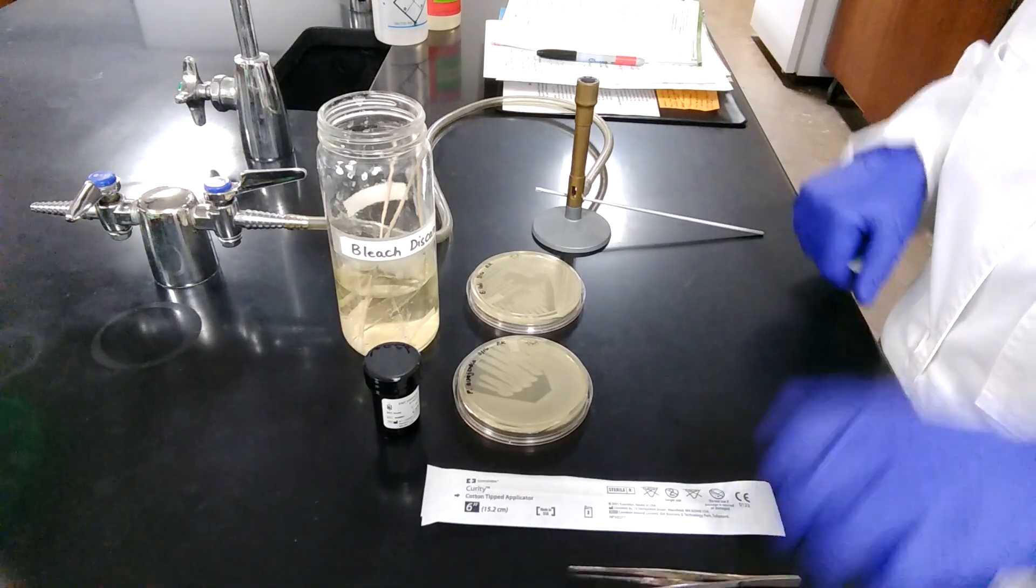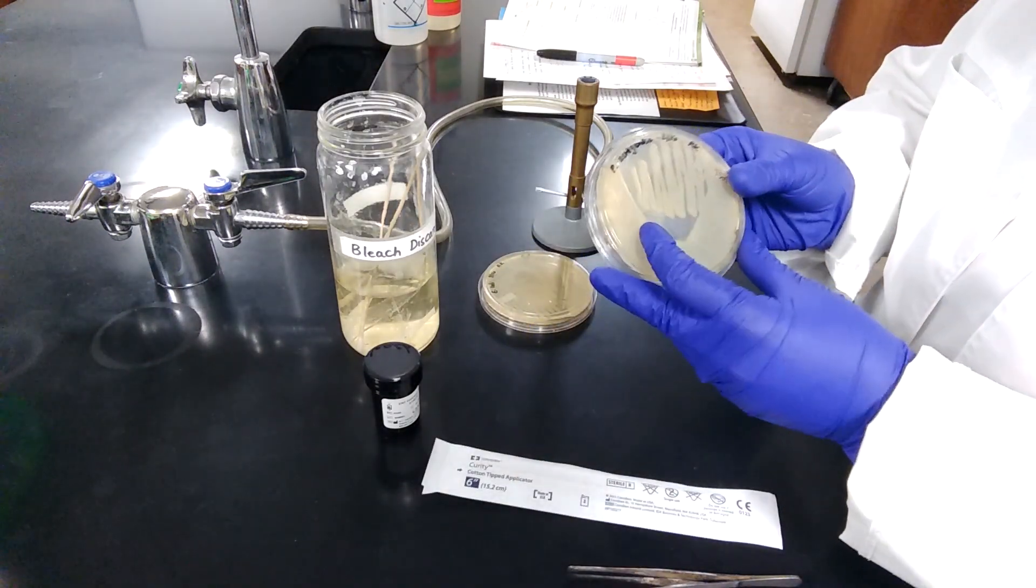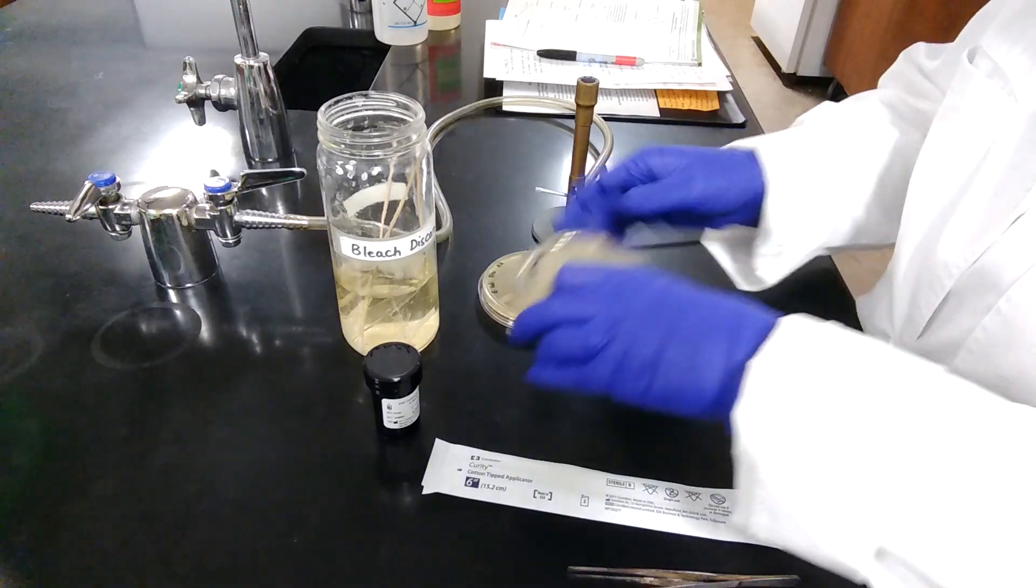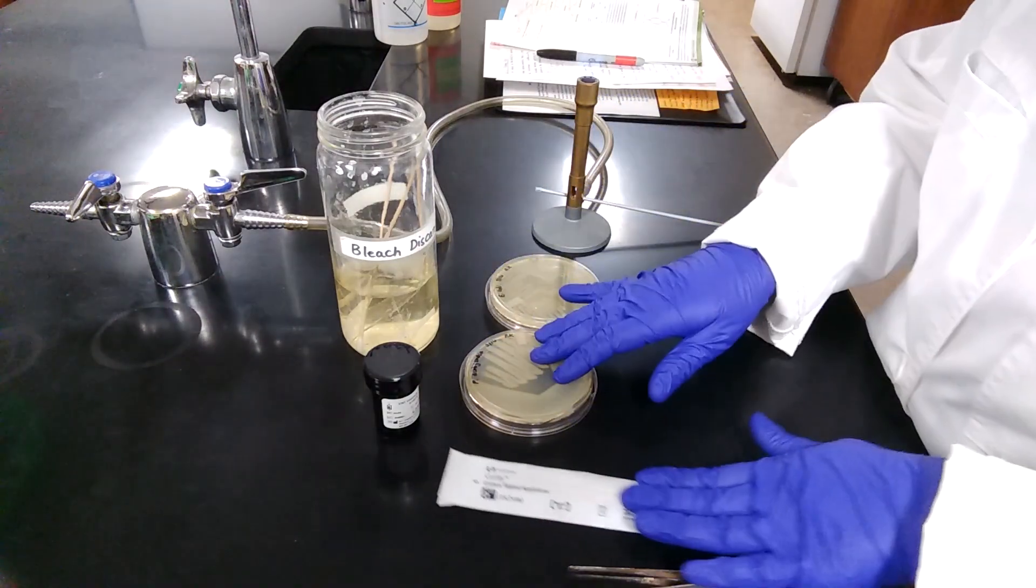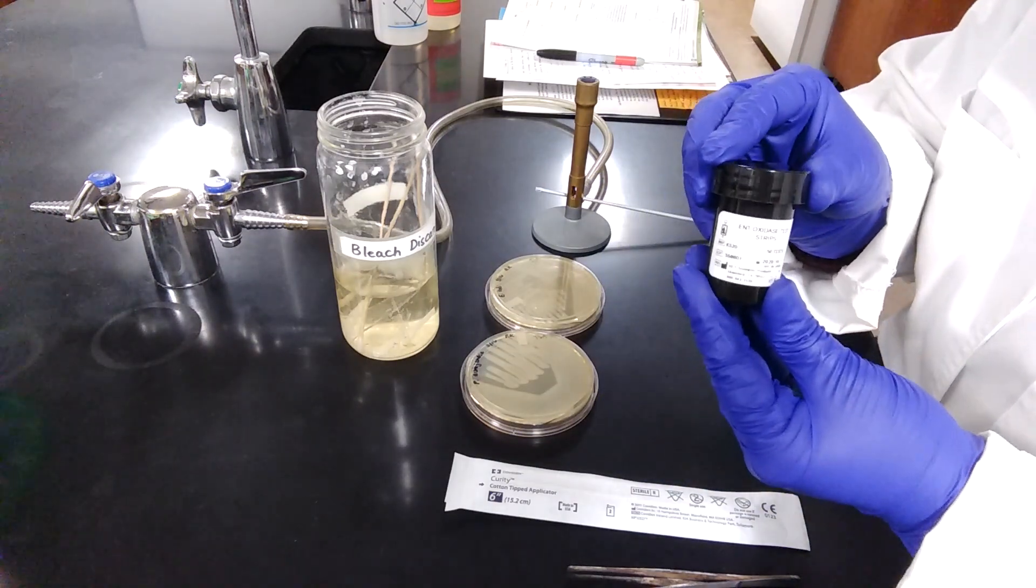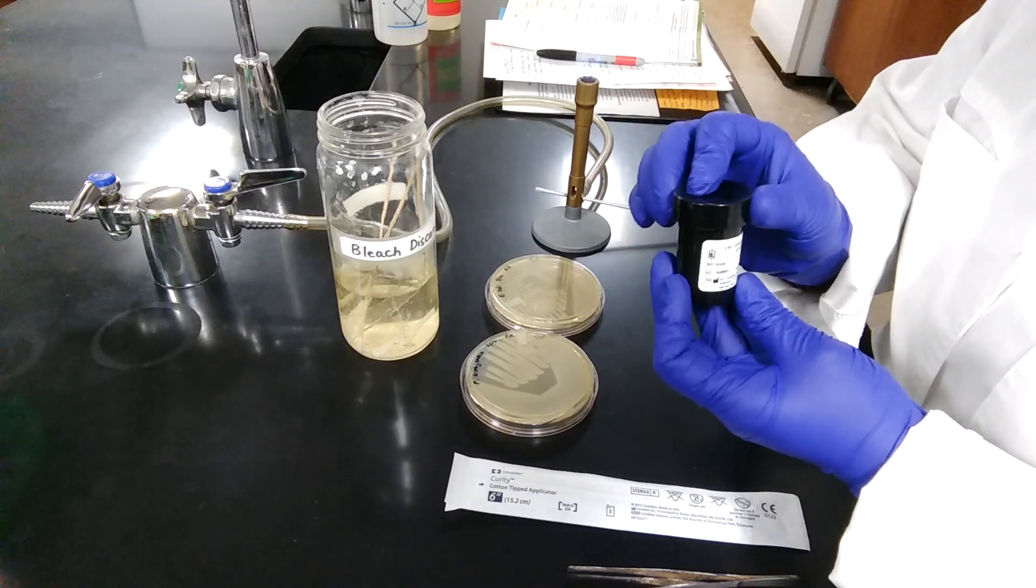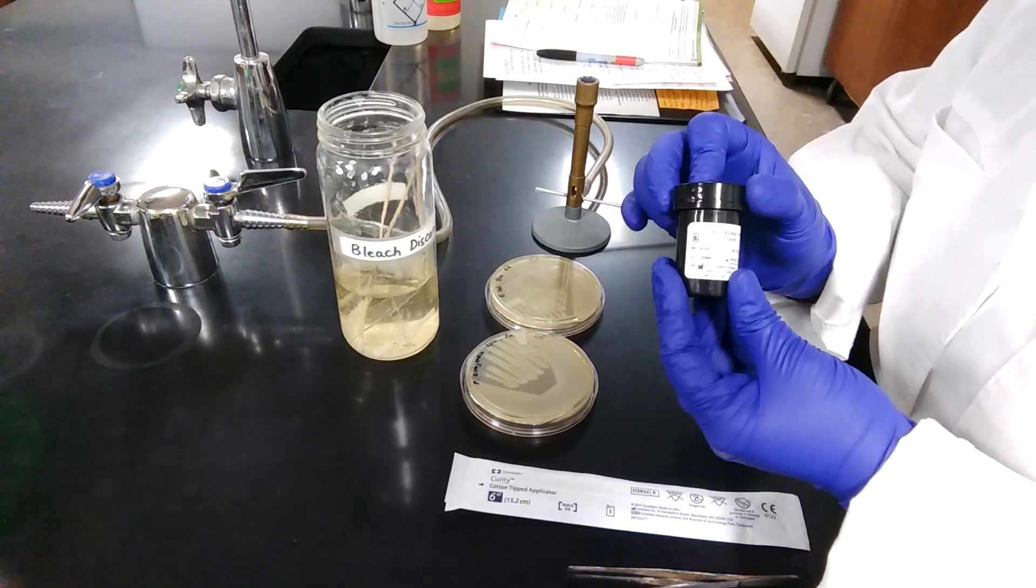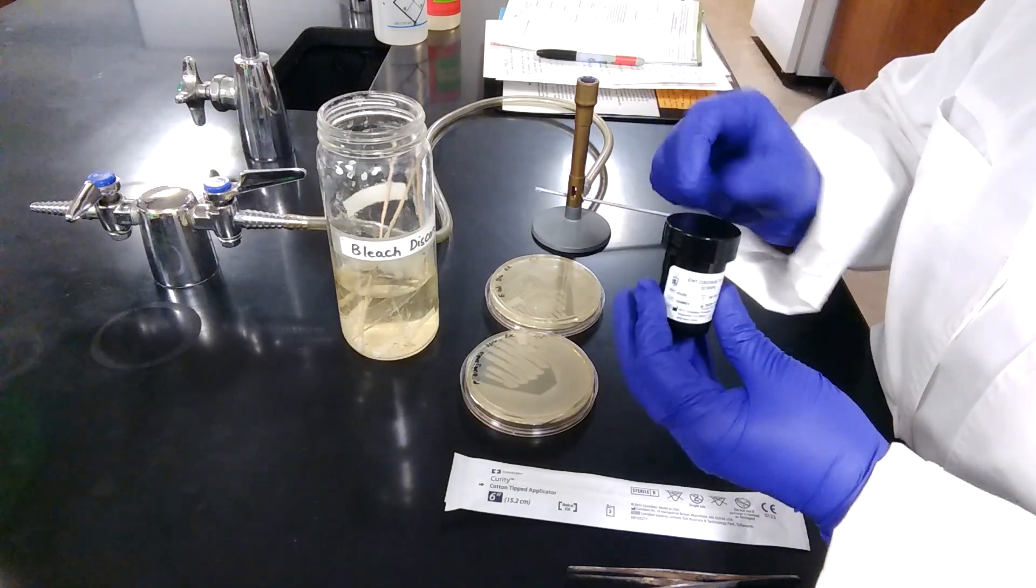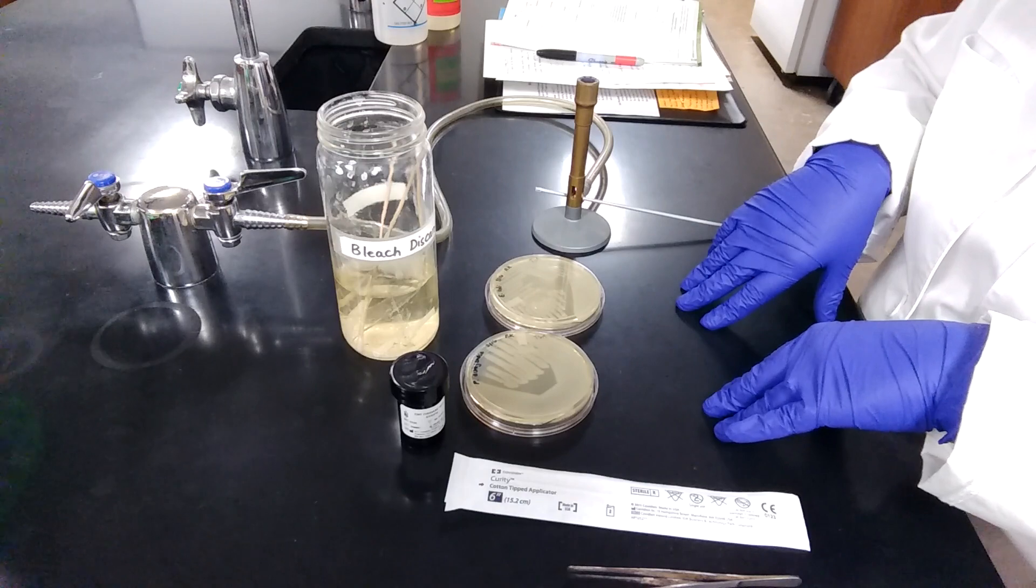So to begin with, we have cultures of two bacterial species, Pseudomonas aeruginosa on TSA plate and E. coli on TSA plate as well. The reagent that we're using is called the oxidase test reagent. Basically, we are using paper strips that are already soaked into the oxidase test reagent and dried. So I'll be just pulling out a paper strip from this container here and doing the test on that paper strip.